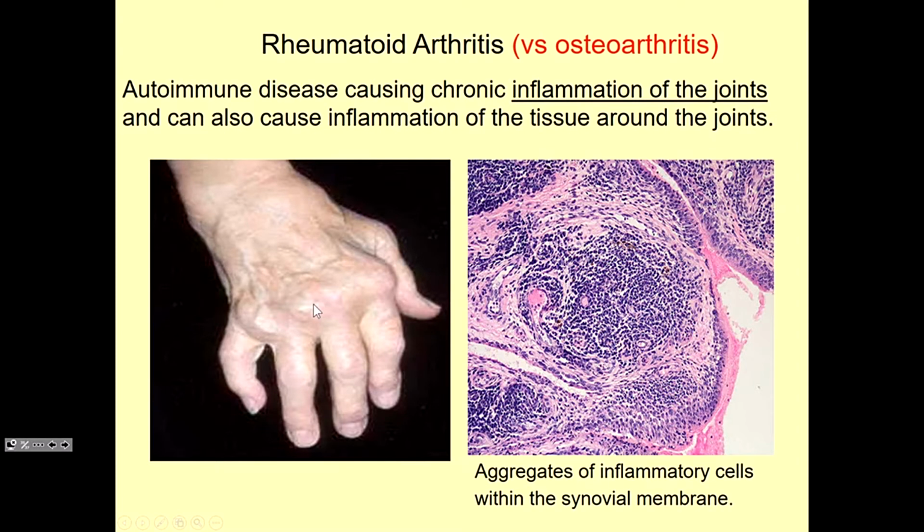Remember the inflammation caused by mast cells and lymphocytes, what sort of mast cells and basophils. Yes, thank you. Basophils, secreting those factors that promote inflammation. So with inflammation, you get fluid flowing into and around the site of inflammation. And remember, we have eosinophil chemotactic factor as part of the inflammatory response. So you've got cells migrating into the inflammatory response. So you see all these cells here. A lot of these would be eosinophils, maybe some macrophages that are in there to phagocytose.